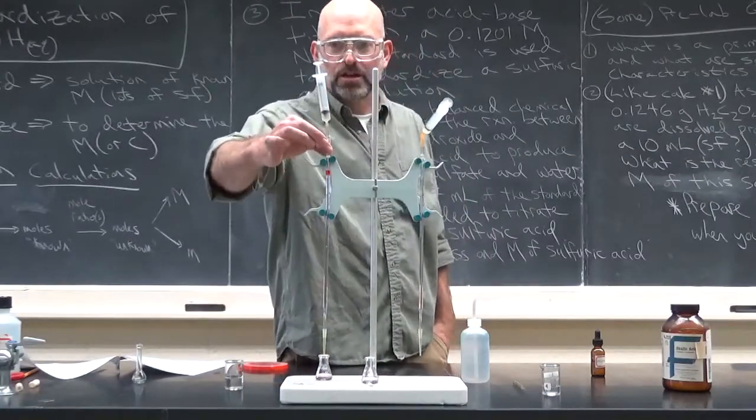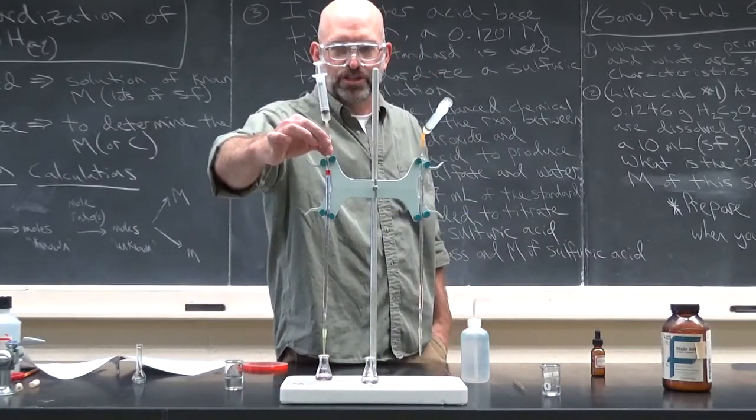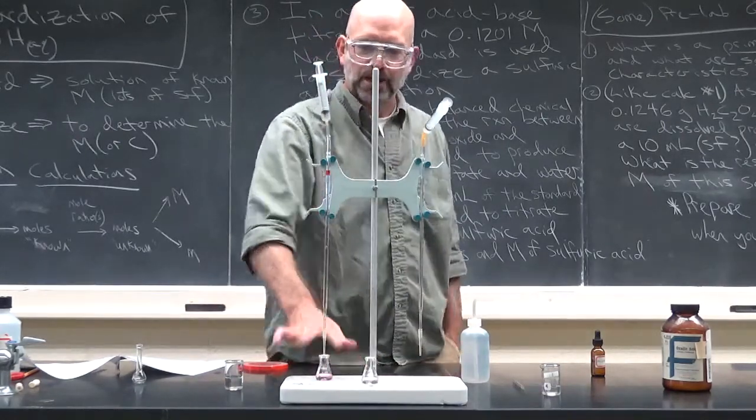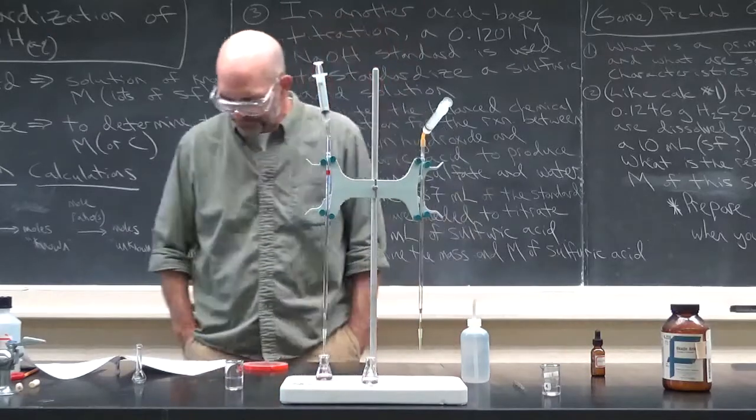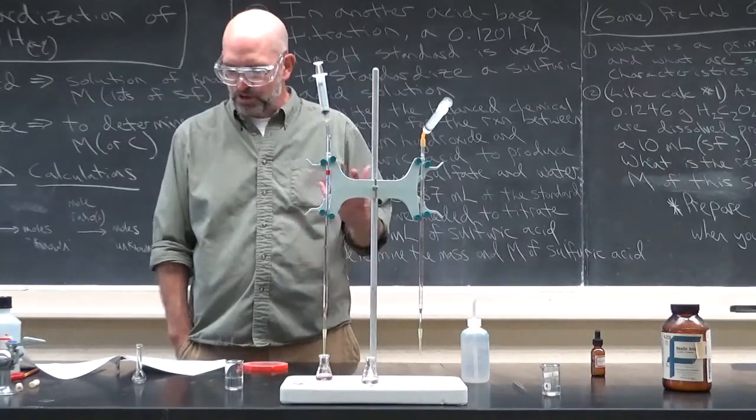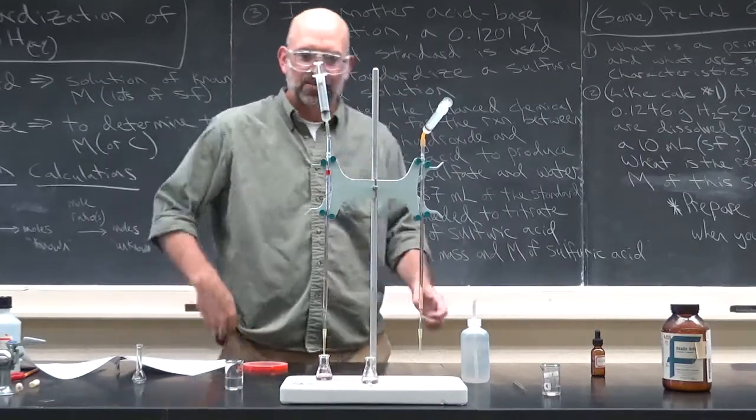So it should get progressively more of the titrant here. Oh, yes, vocabulary. What comes out of the burette is the titrant. And what's down here is the analyte. In this case, it's a little reverse because we know what the oxalic acid is, but I'm not worried about that.